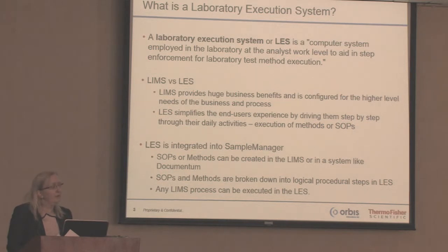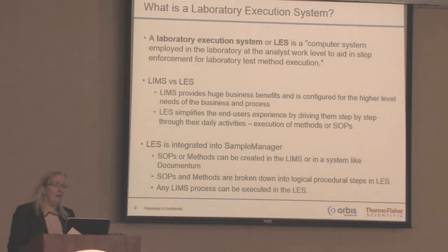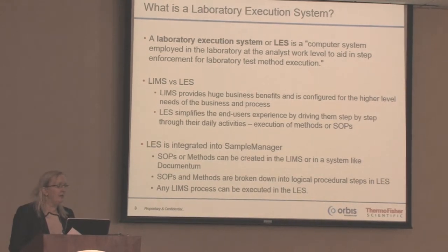You can put your SOPs in SampleManager and have the link there. You can then use that SOP in LES and create an eSOP with the steps of your SOP to create your LES method.